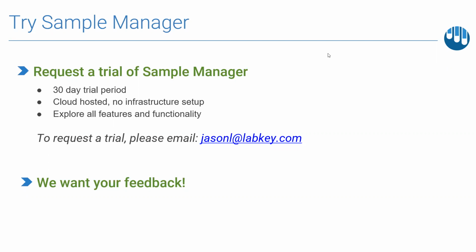Sure. You show the tree spreadsheet again. Sure. If you give me power, give me the screen share, I'll show you that. Give you the power. Okay.